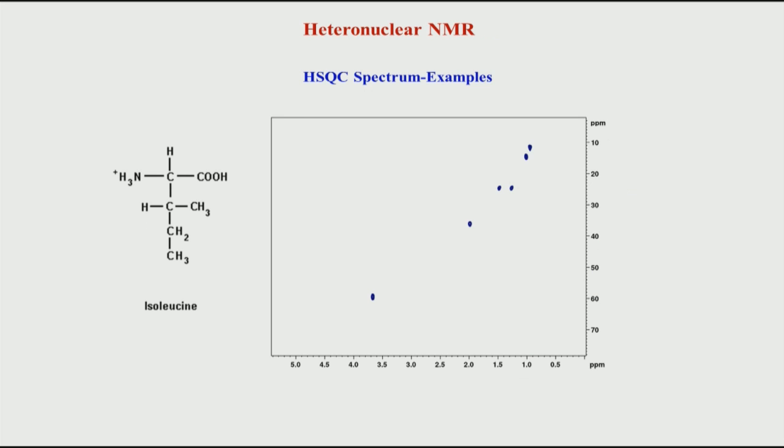Let us move on to another example, so that we can go through all different combinations, and you can see here that this is again an amino acid, this is isoleucine. So, it is a branched chain amino acid. Okay. So, here it has two chiral centers. So, this carbon is chiral, and this carbon is also chiral, and both are in the L configuration.